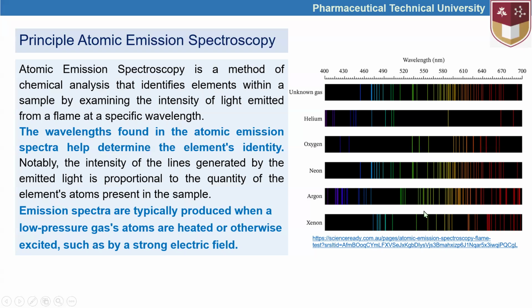And today we have automatically identifying algorithm tools that enable us to automatically identify the presence of the atoms based on their emission spectrum.